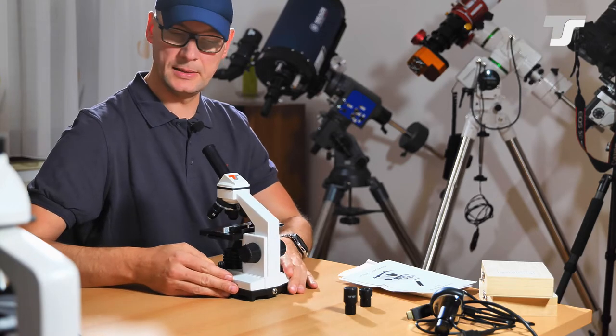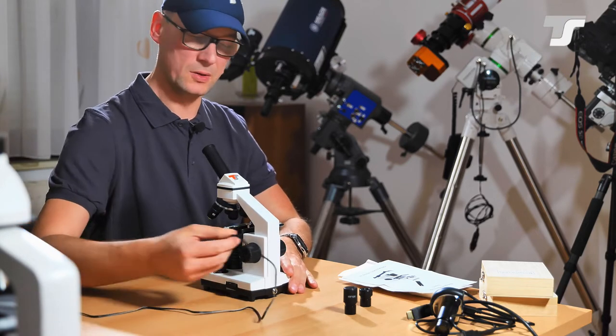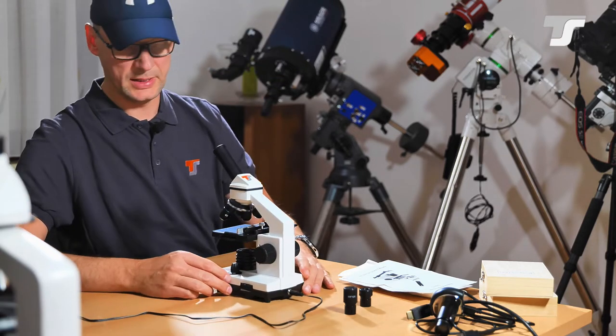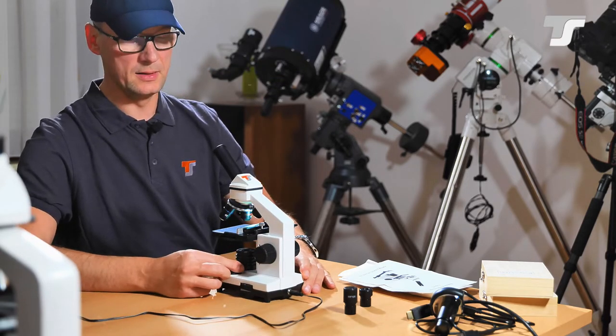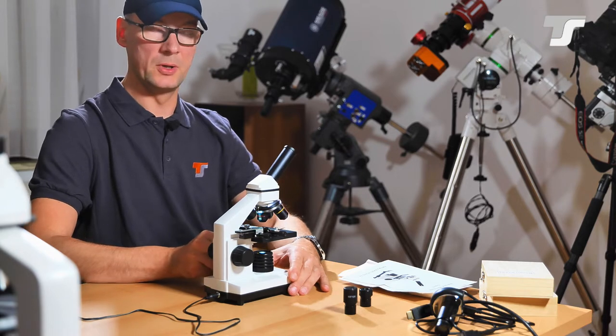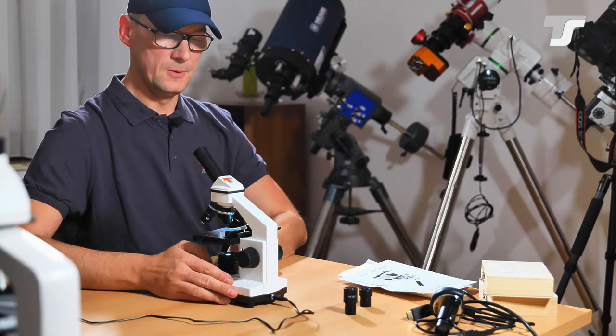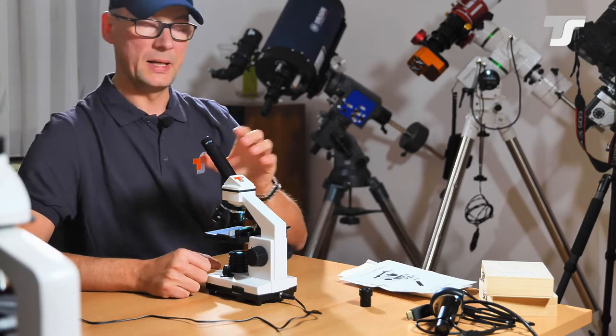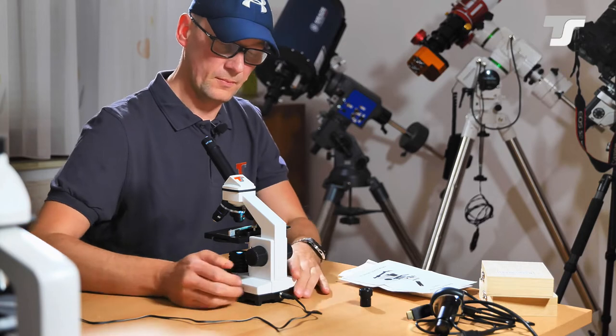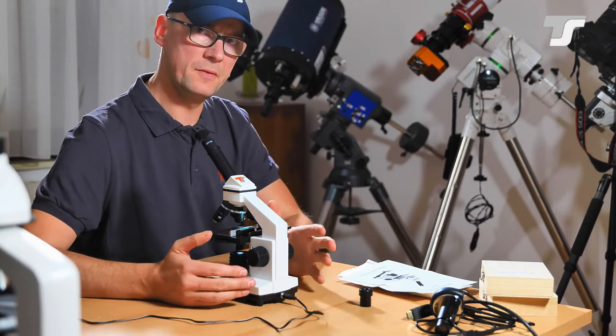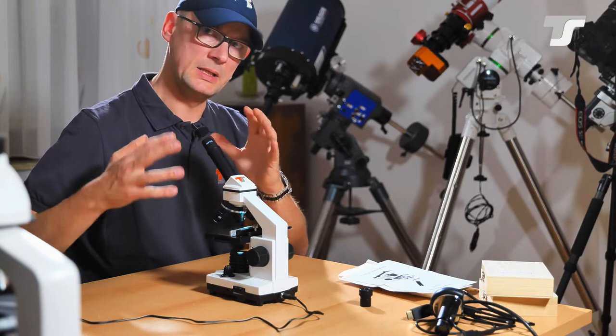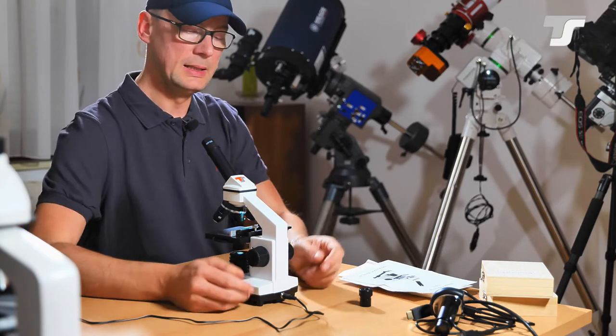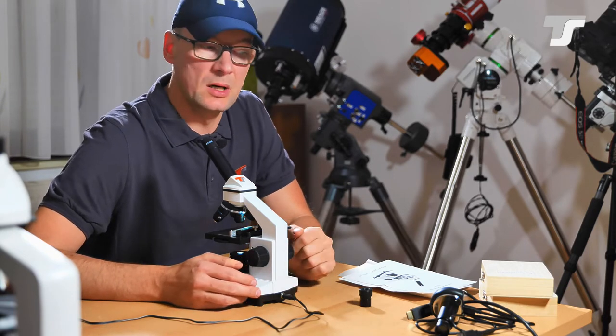So far so good. Of course you get a power supply with it, which comes in here. And then you can enable the proper light source that you need. So that's all for the microscope itself. This is pretty common standard. Nearly every biological microscope comes in that shape. So nothing very special, nothing different.